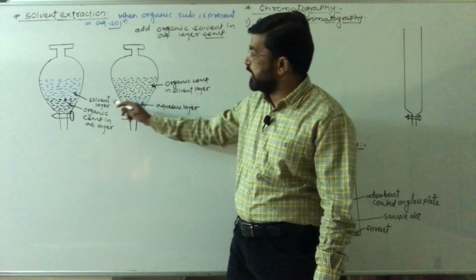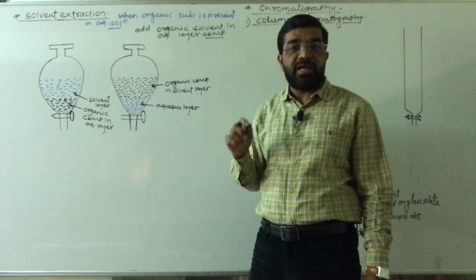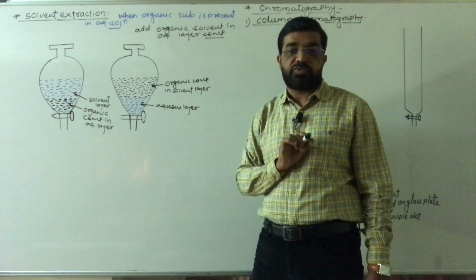Such a solvent we have to add to this aqueous layer containing the organic substance.